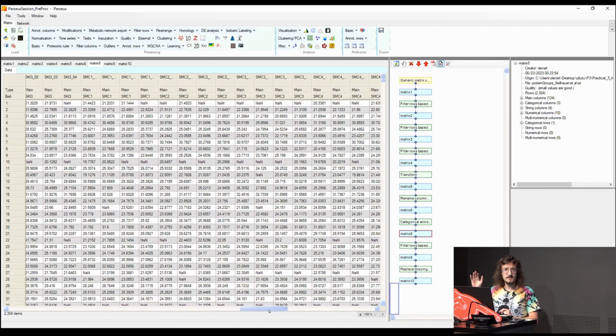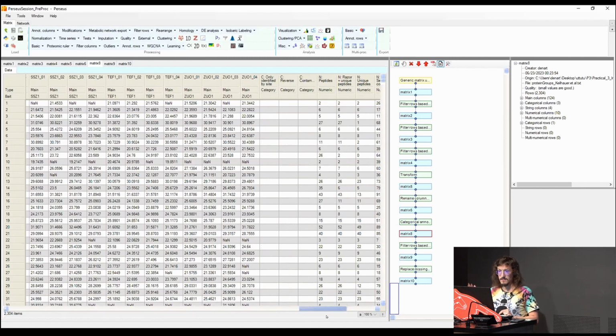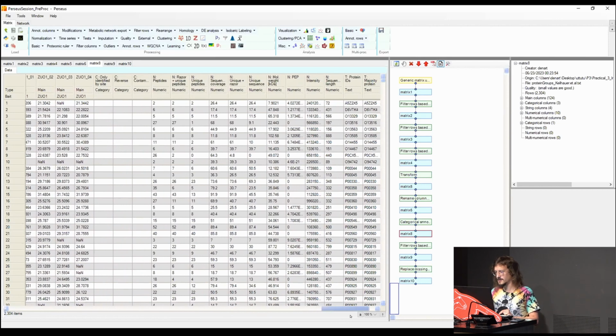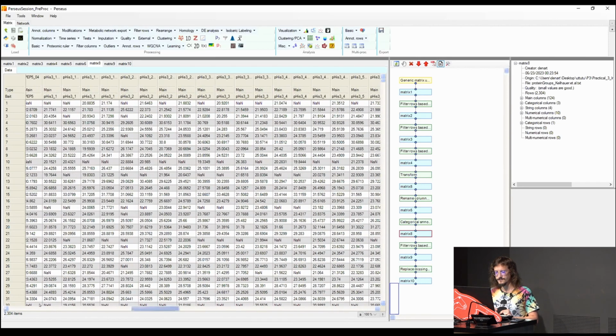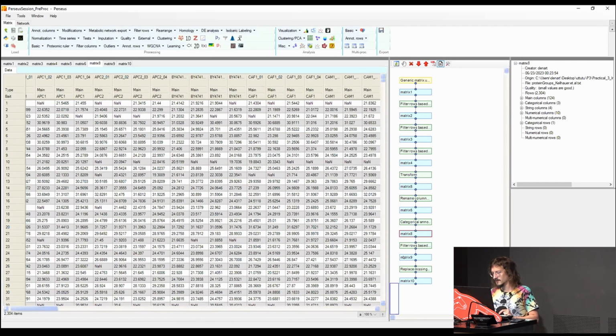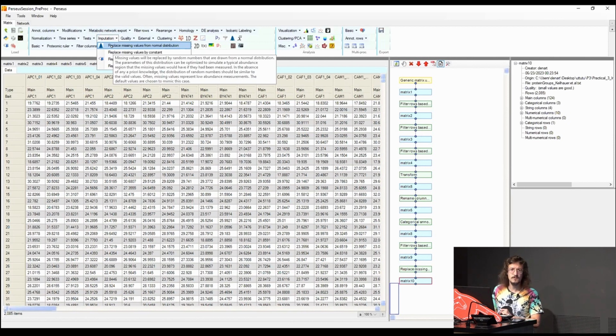As I said, they didn't care about what they were sequencing, they just sequenced everything. So these values may come from specific and non-specific binders as well. And then here, as usual, the other information about your experiment. Filtering was done, and then at the end, data were imputed. The imputation was done with the normal imputation that you saw yesterday, replacing missing values from a normal distribution.